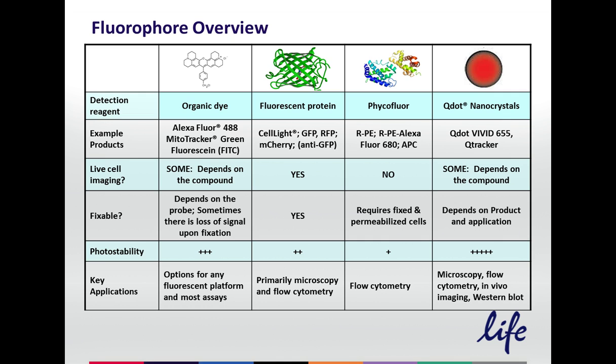Now this next slide is really the meat of the whole presentation. This is the most important one because it compares some of these characteristics between each of these four classes of fluorophores. So I'll dwell here for a little bit so you can see it. Again, this presentation will be available later.